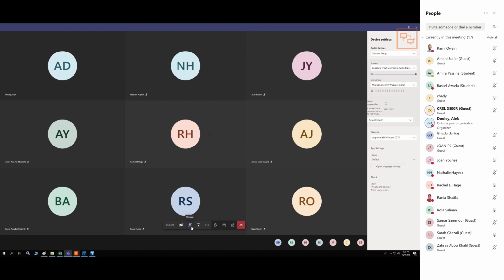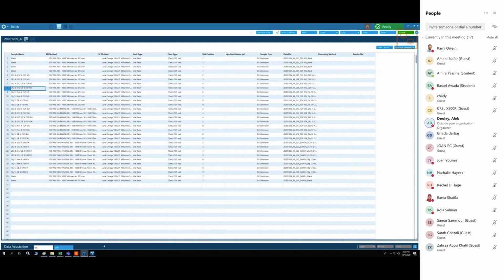Absolutely, yeah, sure. We will definitely do that. We're out of time now today, so we'll definitely do that tomorrow for sure. We need to do that. That's definitely on my agenda. Well, what we'll do is tomorrow we'll check this data in the analytics, and we'll just review how to look at it.